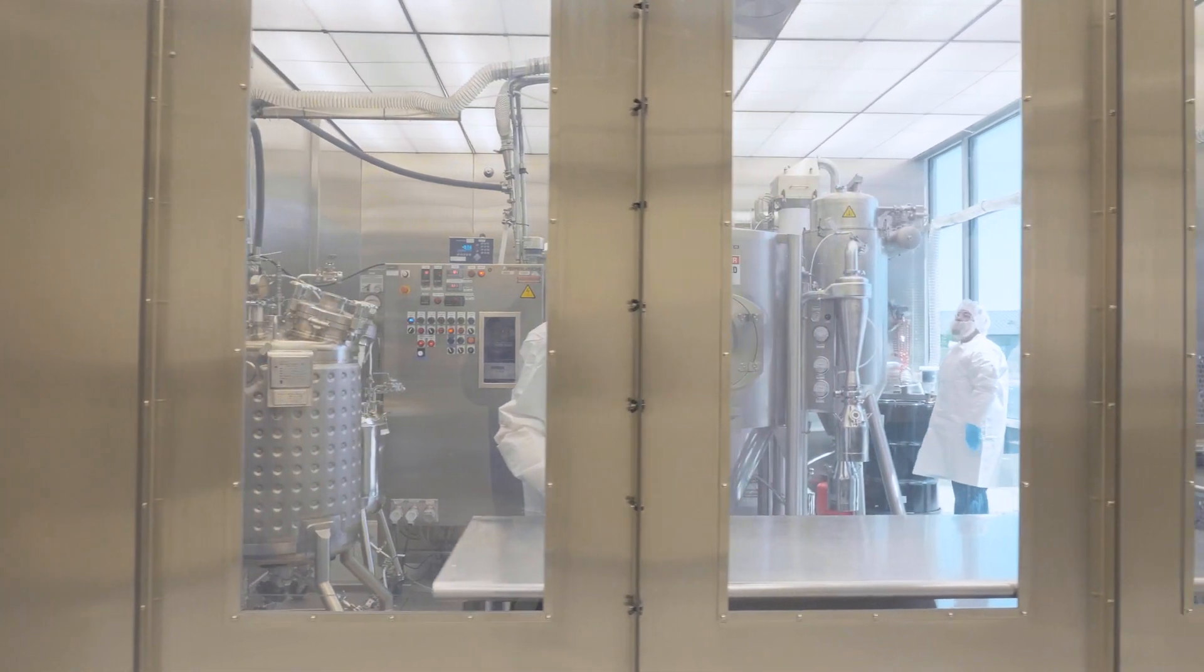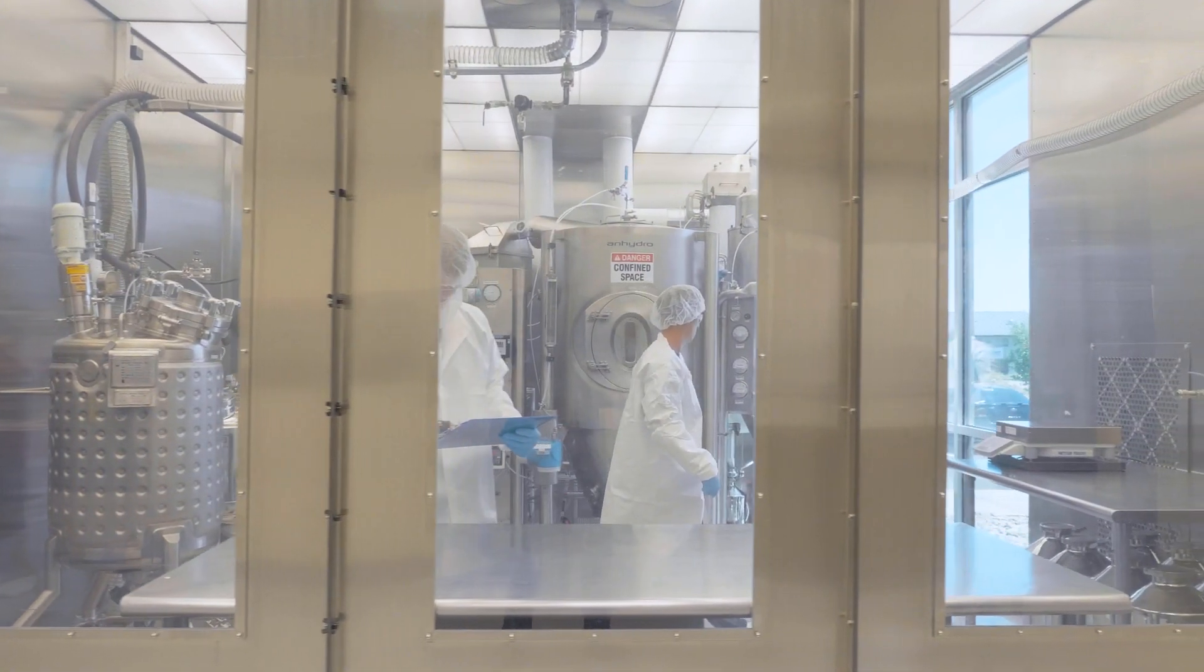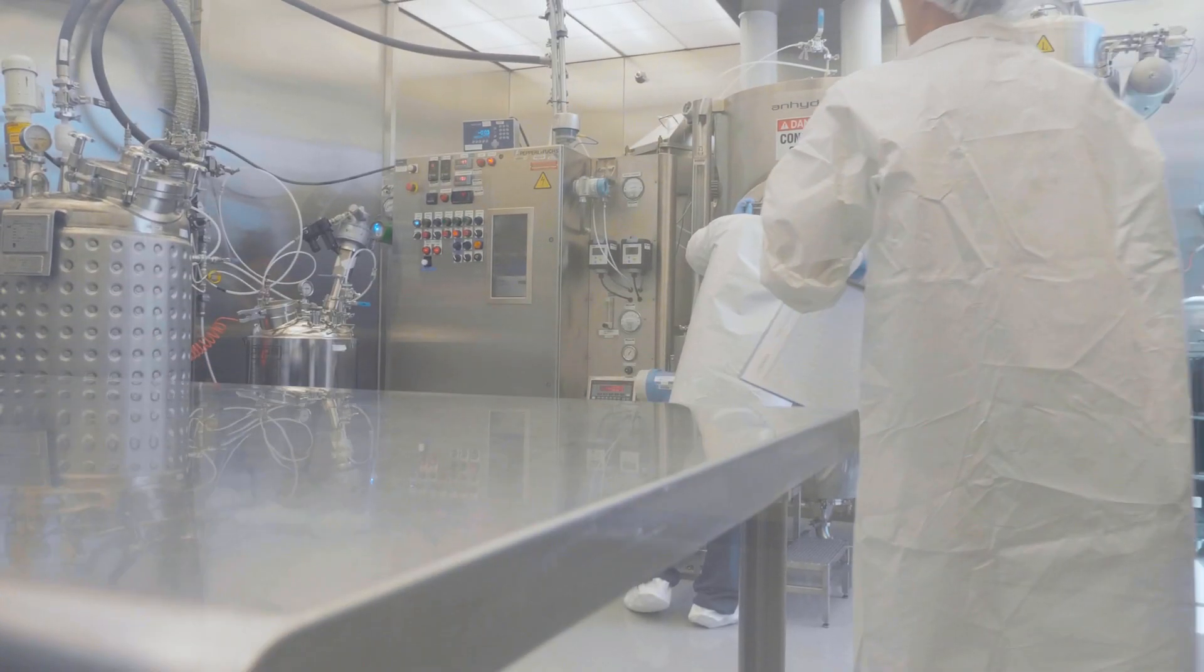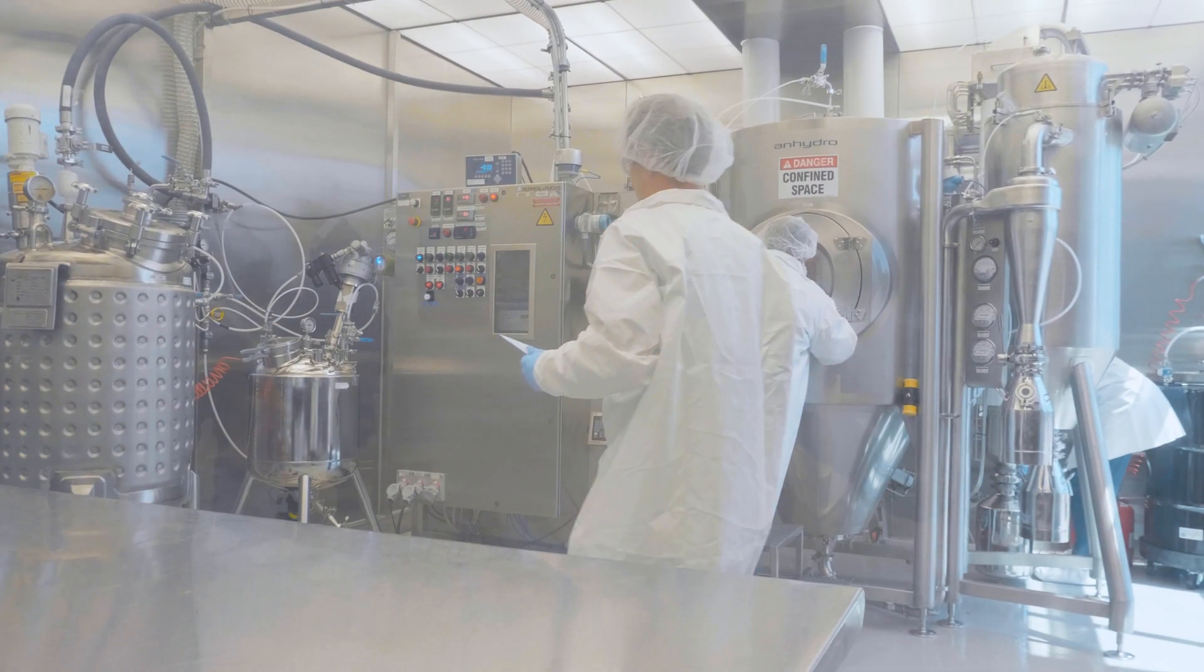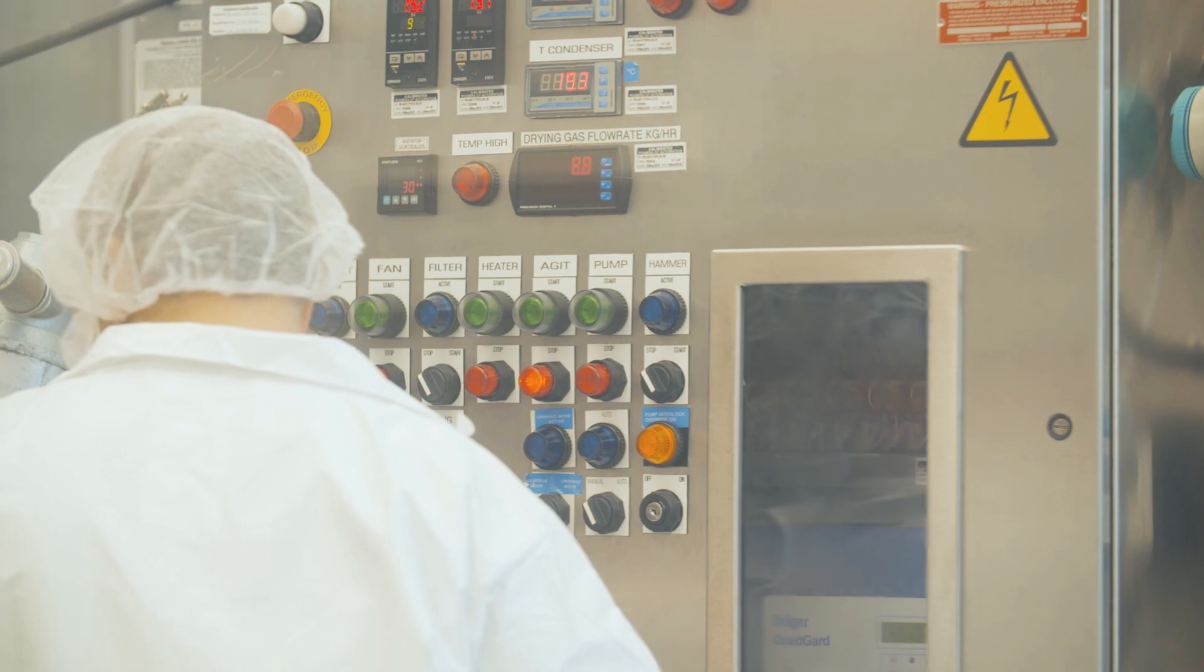The pilot scale GMP at the Bend, Oregon site consists of two pilot scale spray dryers. One is an Anhydro MS 150, another one is a GEA Mobile Miner. These are capable of doing tens of kilograms of spray-dried intermediate.